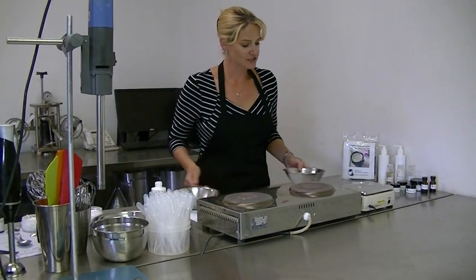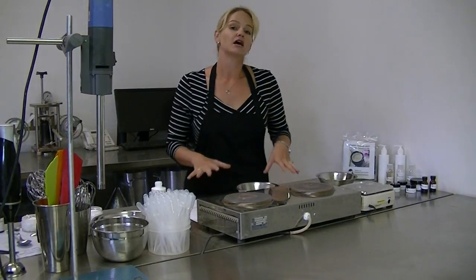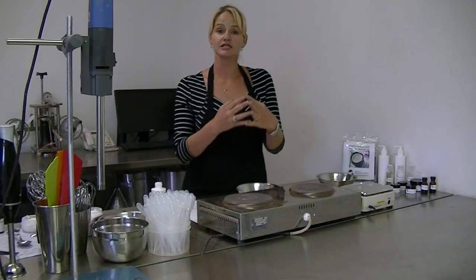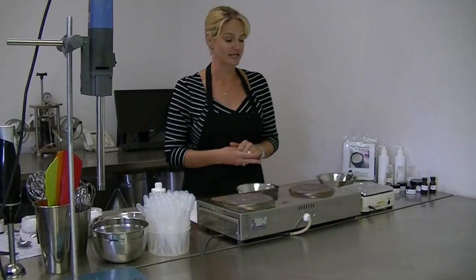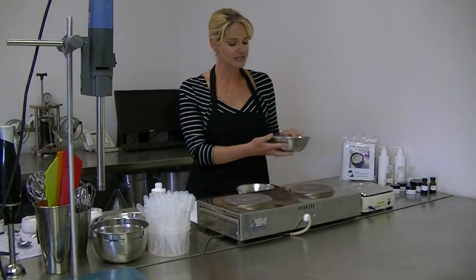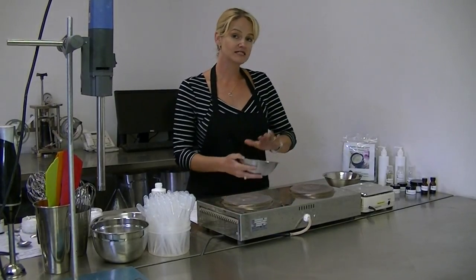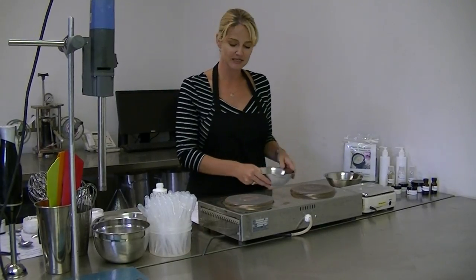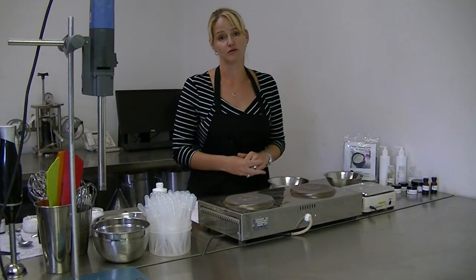We're going to start by measuring out the different phases. When creating an emulsion, the entire principle is to mix oil and water phases which would not normally be miscible in each other. I've already measured out our water phase. I'll now be measuring out our slurry phase — in this step this will be to hydrate a gum easily and effectively. I will then be measuring out the oil phase and showing you the emulsion step.